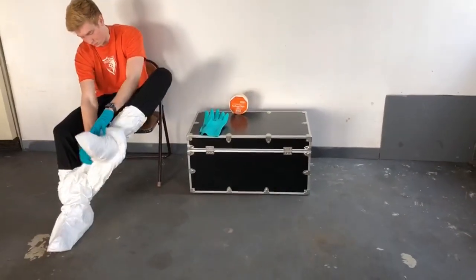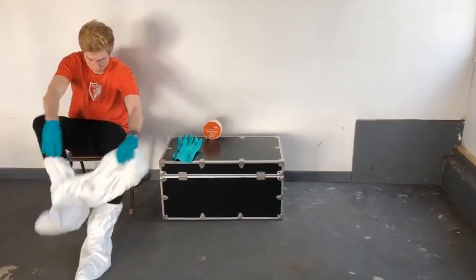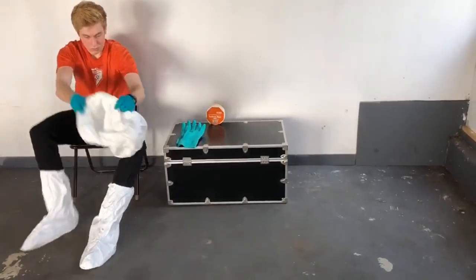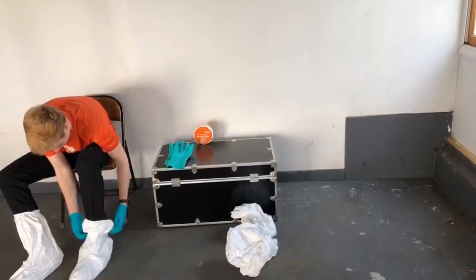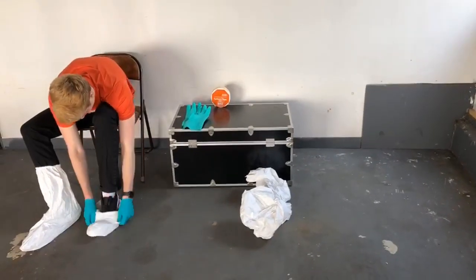He's going to remove the garment over the boot covers that he's wearing. Next, his foot protection will come off. Once again, same drill — he's going to be very careful to have the outside of that shoe cover or boot cover not come in contact with any skin or clothing.